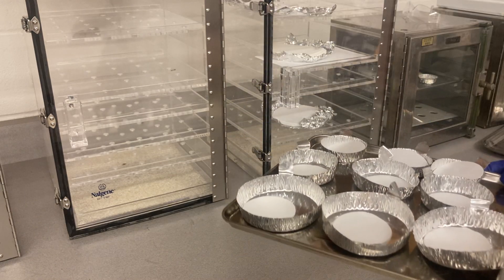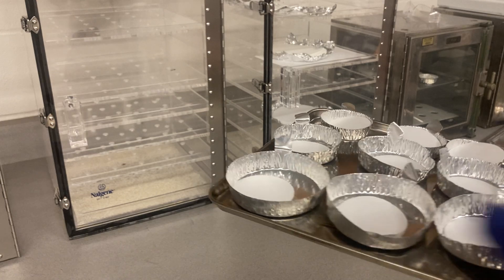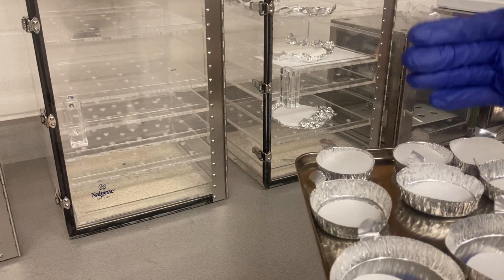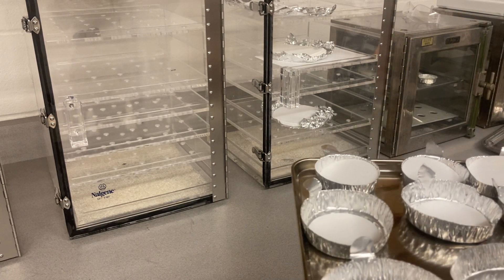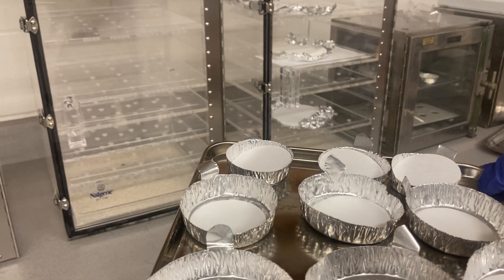So this is step one. Make sure you know which one is your sample, which is the first replicate, and which is the second replicate. Then put the filter into all of them — only one filter each — and use tweezers at all times.